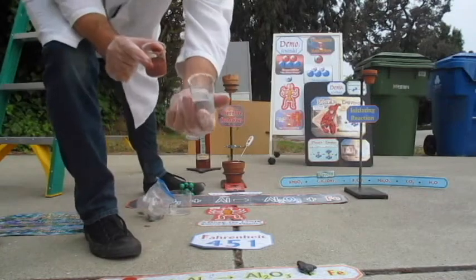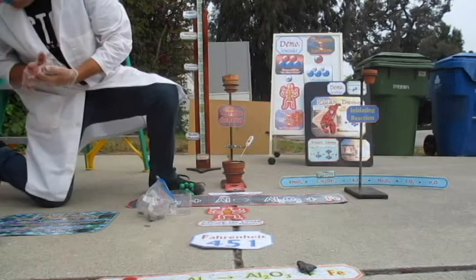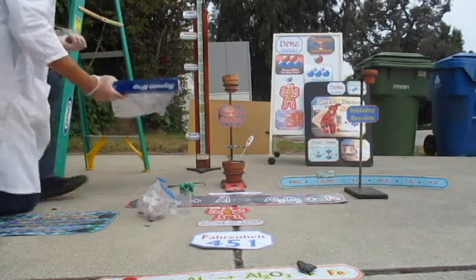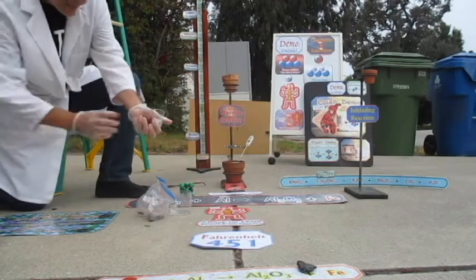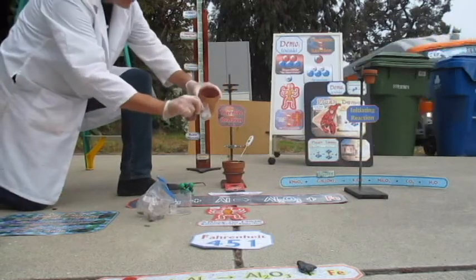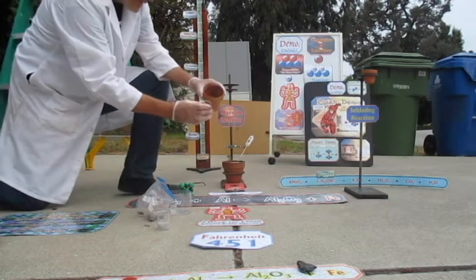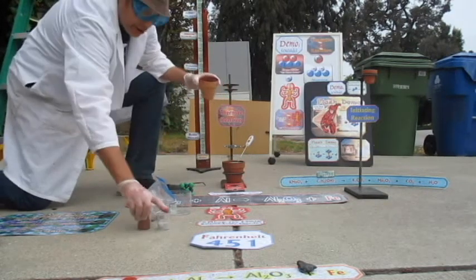And then this one is aluminum powder, which is the same thing that is in aluminum foil, which I have right back here. It's the same exact thing as aluminum foil, just in powdered form. And then I've mixed them together, and notice that you don't even see the aluminum anymore. All you really see is the hematite because it overpowers the aluminum, it coats it.